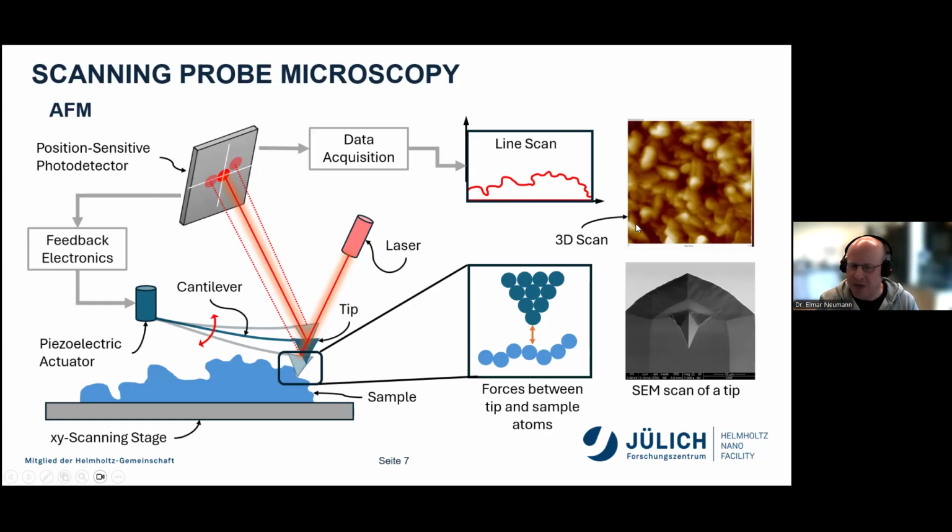And with this mode, you can get even sub-nanometer resolution.